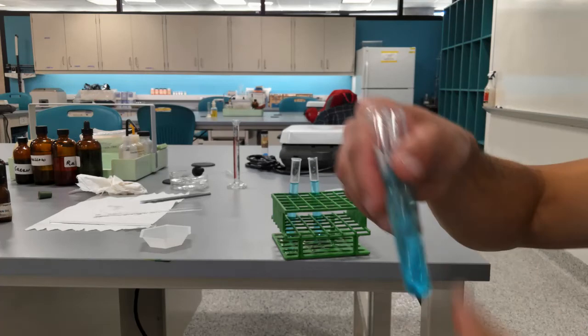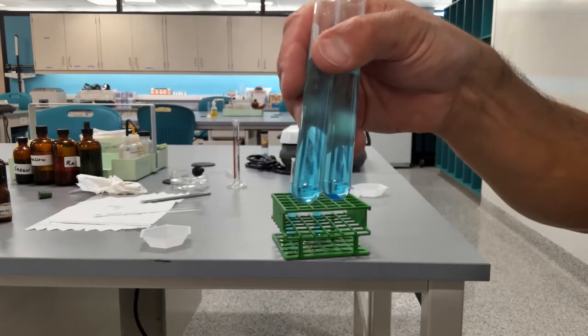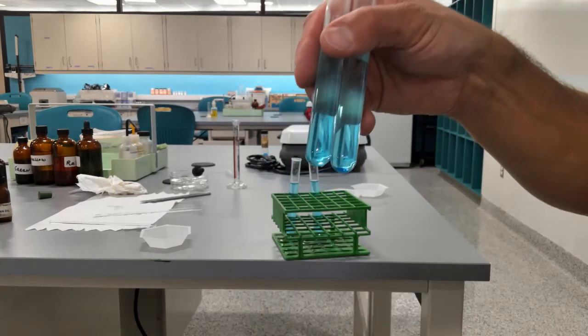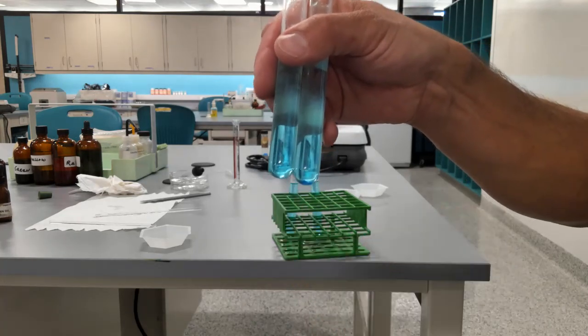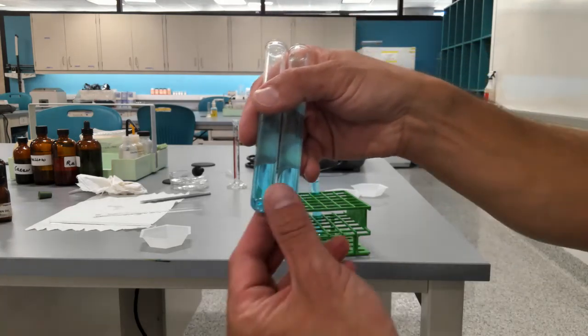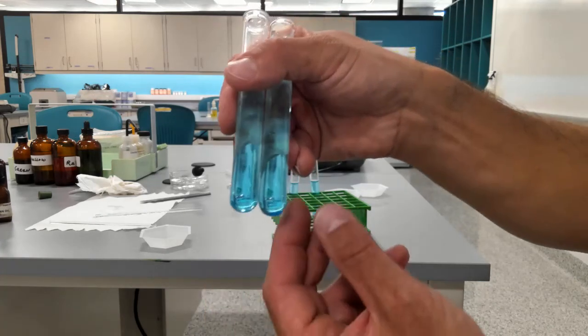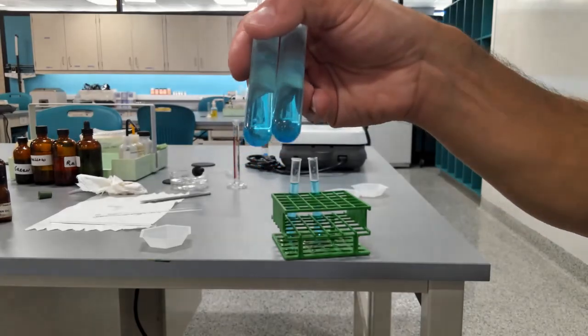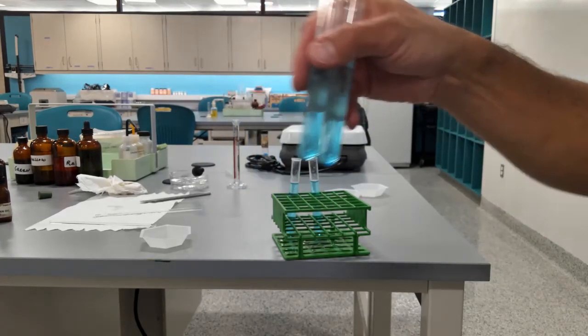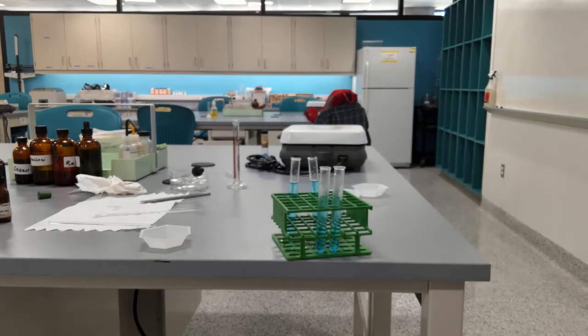So after the same number of revolutions, you can clearly see that the copper sulfate with the finer structure here is fully dissolved, while the crystalline copper sulfate, not the granular, is not dissolved yet and is going to take some time to fully dissolve. So the smaller the particle size, the faster the diffusion.